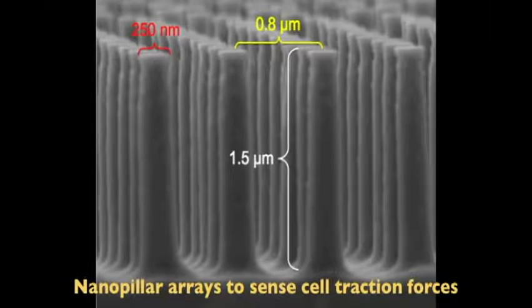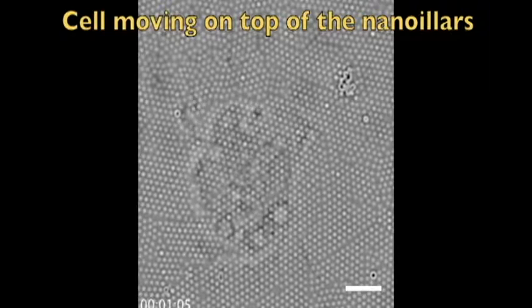Here we show you our engineered nanopillar arrays made of elastic polymer. Cells are sitting on top of it and apply mechanical force to the pillars, deflecting them.